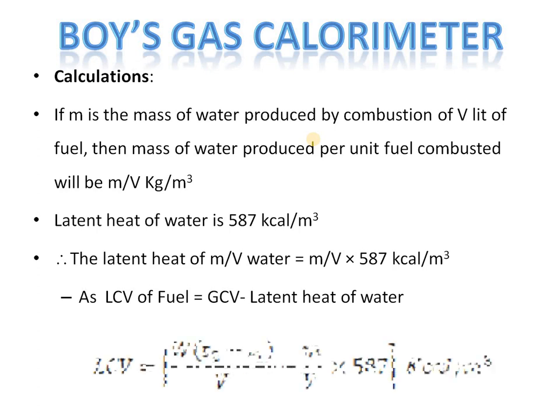Hence LCV will be equal to capital W into (T2 minus T1) divided by V, minus m upon V into 587 kilocalorie per meter cube.